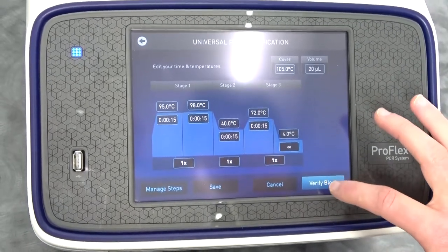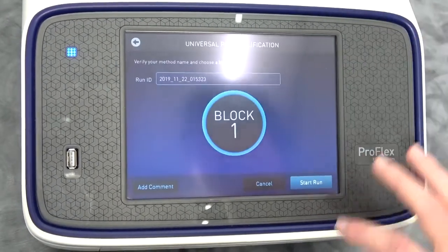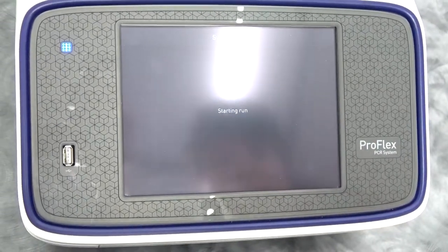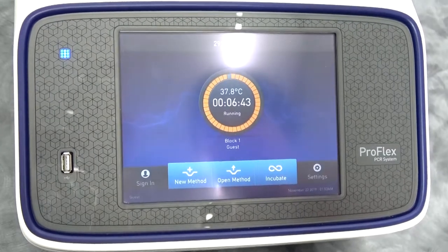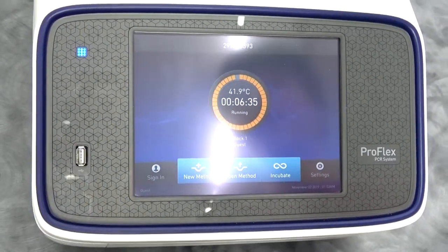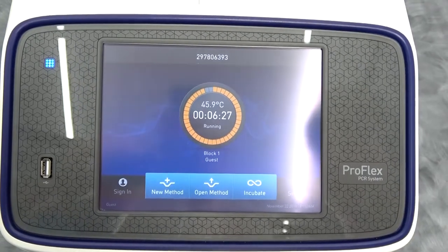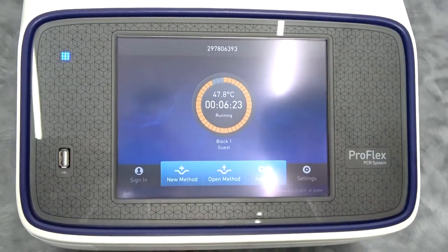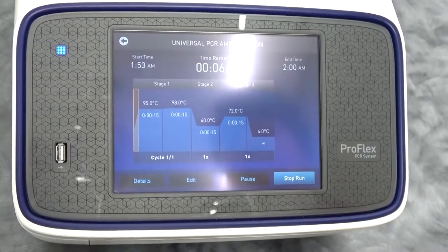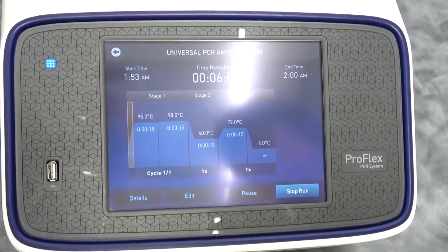Once we've got everything set, we're going to click Verify Block. It wants us to verify the method — I can add a comment, which I'm guessing appears when you export your run data. Then we confirm the block and hit Start Run. As you can see, even as a novice with this instrument, I have no problem setting up a run. The status screen tells you the start time and end time, which is really cool — you know when to come back and when your reaction is finished, useful for budgeting your time in the lab.